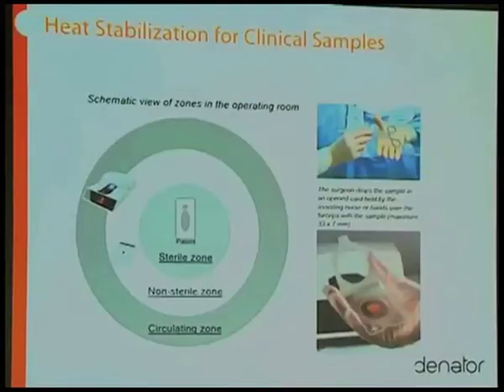That was the examples. Some words on using the heat stabilizer in a clinical setting. The majority of work that's been done is done in the university setting, laboratory animals primarily. It is being used in some hospital settings for clinical research. It's not in routine use, but people that are interested in changing the way treatments are being done, in a few cases, primarily involving biopsy sampling.